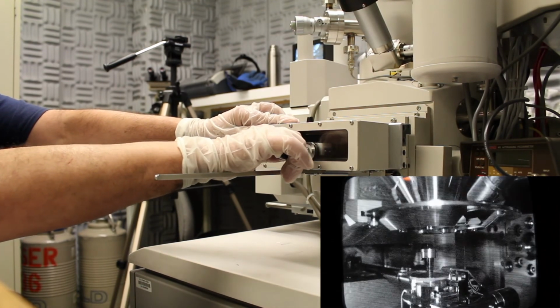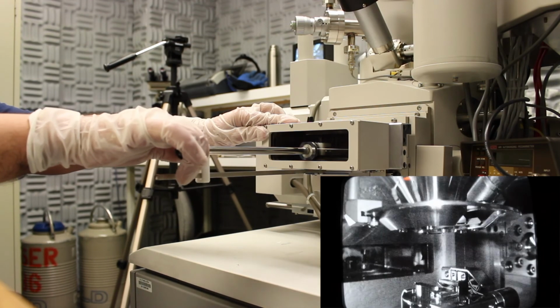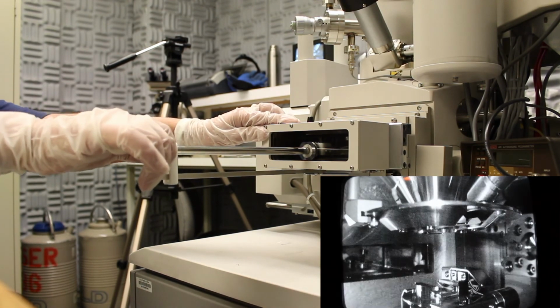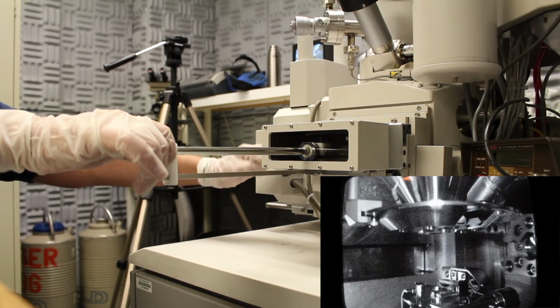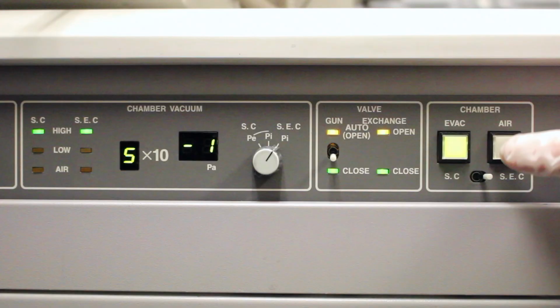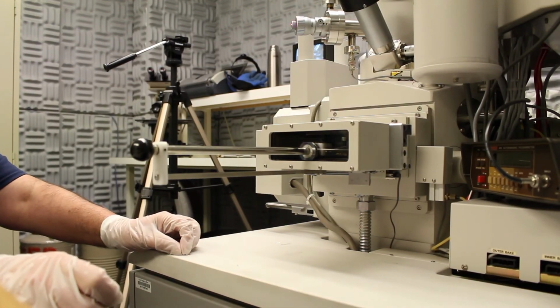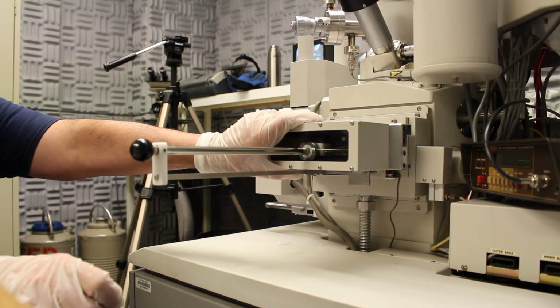on the stage. So here we go. Retract nice and smoothly. Bring it close to the end. Hold it there. Close the manual valve. Now we can lock and vent. This will take a couple of seconds to get to air. And then we grab the housing.